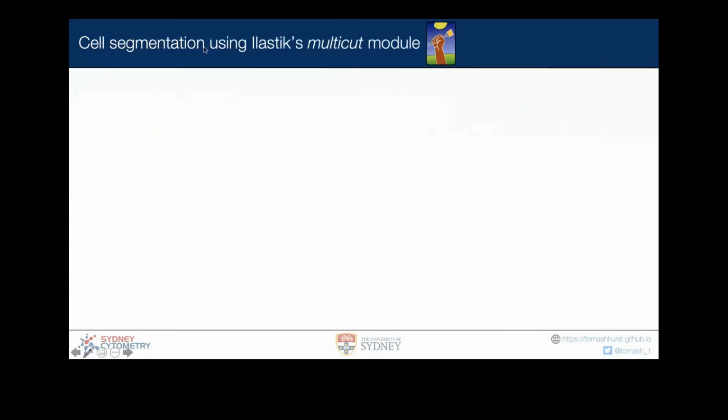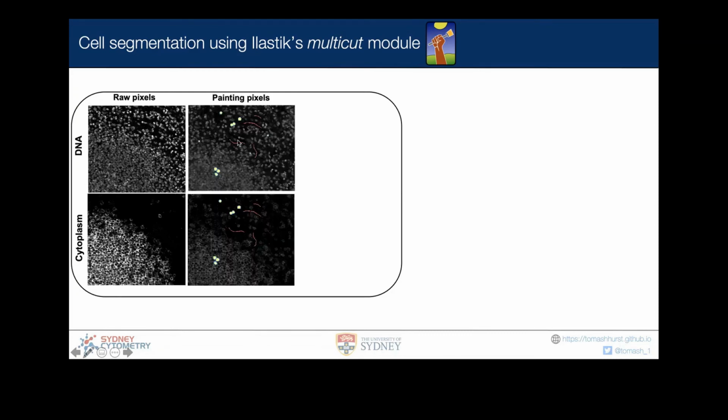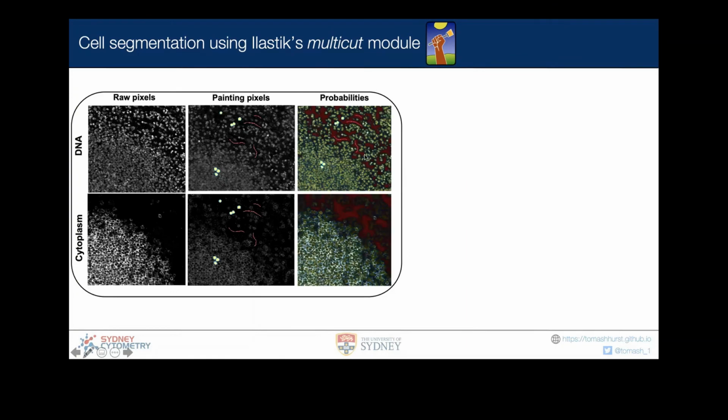The first thing that we do as part of this workflow is segmentation. We use Ilastik for this, which is an open source software tool. What we can do is take, in this case, DNA, so we can take signal from DNA or various cytoplasmic markers. We can physically draw, kind of like with Microsoft Paint, areas that represent background or cell borders or the nucleus. When we allow the computer to look at that data, it can use that as training, and then it can predict what it thinks each pixel in the image belongs to.